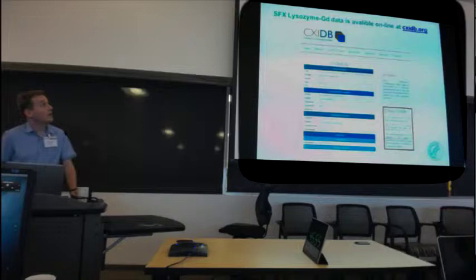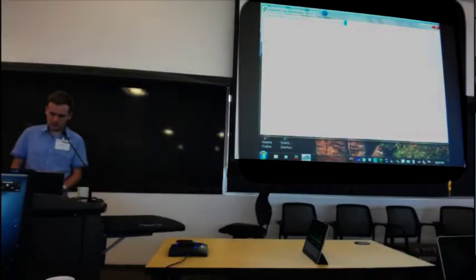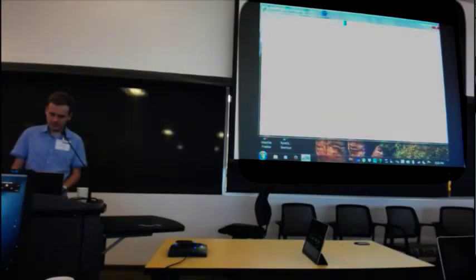I hope that all of you followed this step and have logged in. Now what we need to do is to SSH to PS ANA. Has everybody SSHed to PS ANA already? Okay.